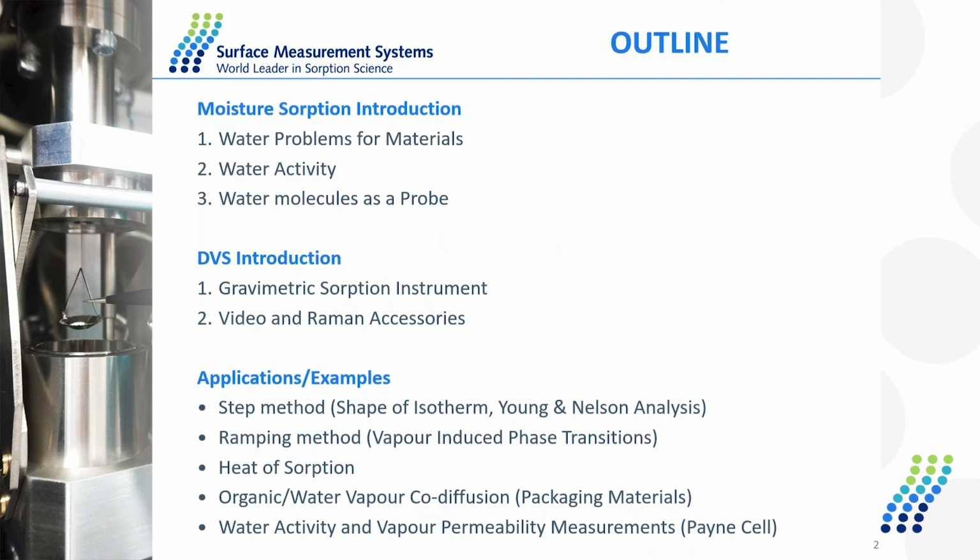So first, we will have a brief introduction about the sorption process. And then we will talk about the DVS technique and go through some of the applications in detail, like the isotherm measurement, the vapor-induced phase change, the permeability studies, as well as the water activity determination.